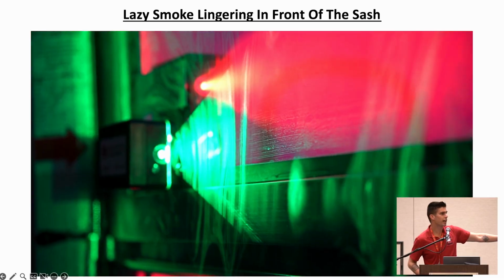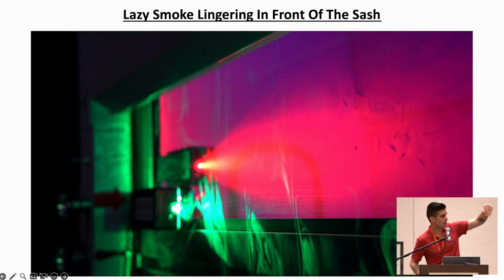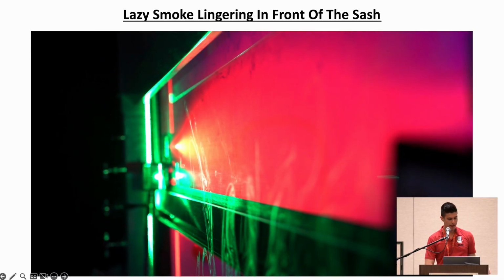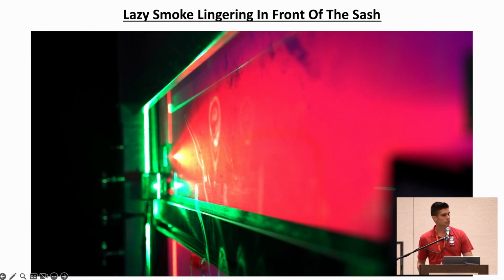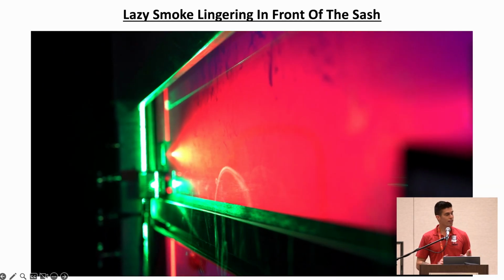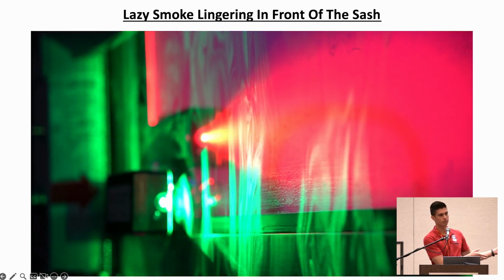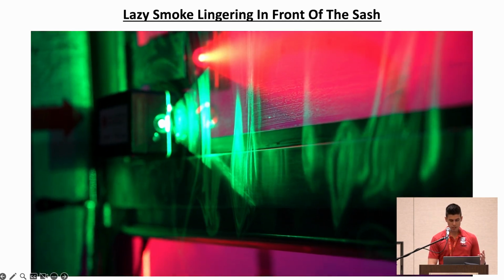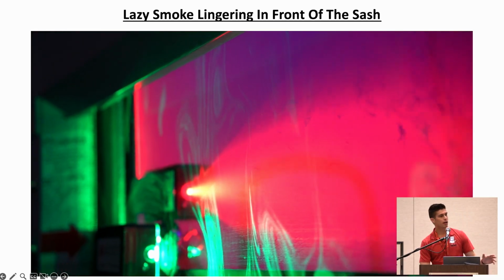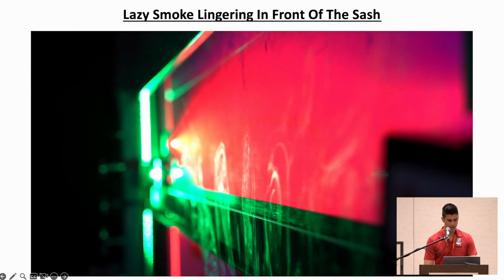If I'm standing next to that hood and the hood is allowing smoke to pass up, and good for the hood, it's been sucked back in there. But that is passing directly in front of somebody's breathing zone, and mistakes like this happen a lot. And without lasers and just smoke, you couldn't see some of these phenomena. So that's why, since 1991, I think it started in Taiwan, right? A scientist in Taiwan started adding lasers to his smoke tests.